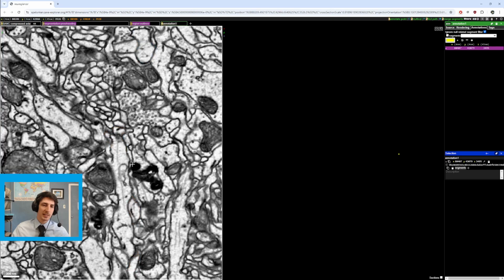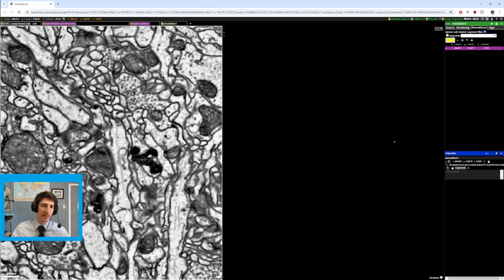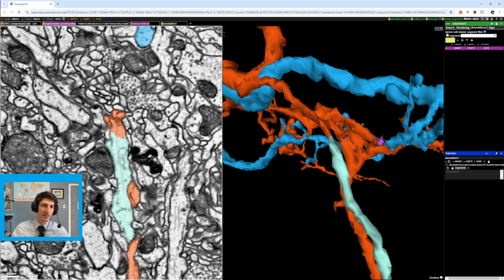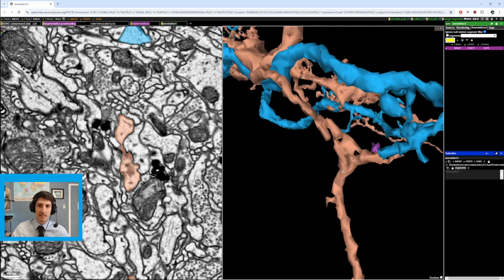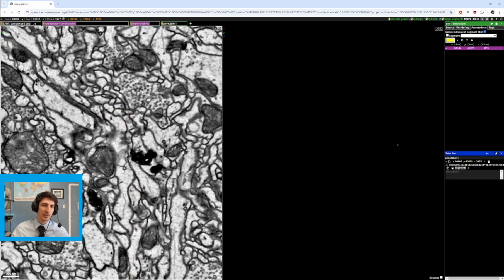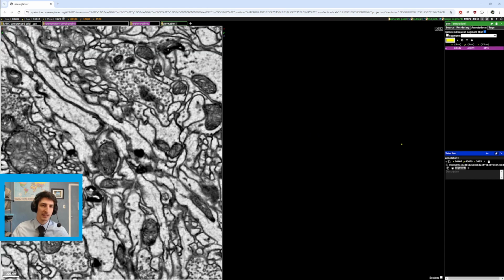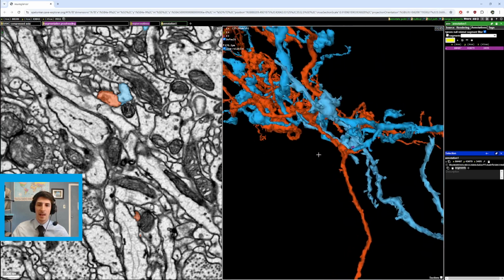And as we inspect it, it's pretty obvious from the look of it that this large branch jumps up over here, and that is a pretty good connection. Our soma tract is thinner, I should say, than this. And as you can see, it is a merger, two ERs right next to each other, contained in different membranes. And this jump's a little tricky, but it's not that bad.